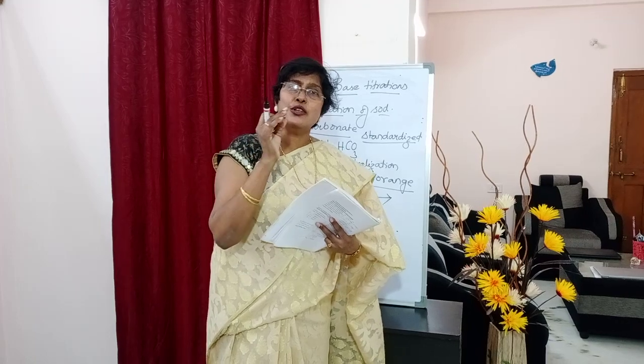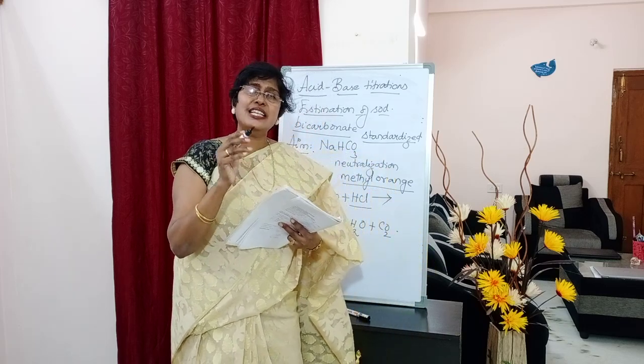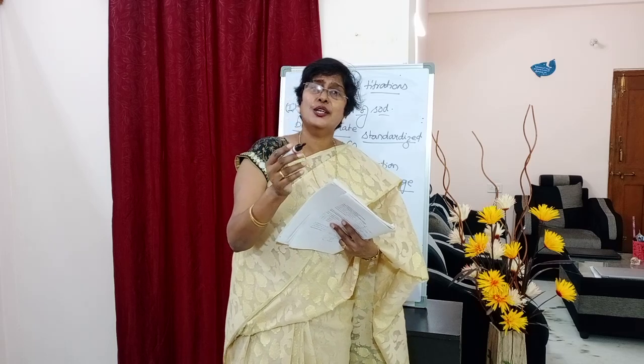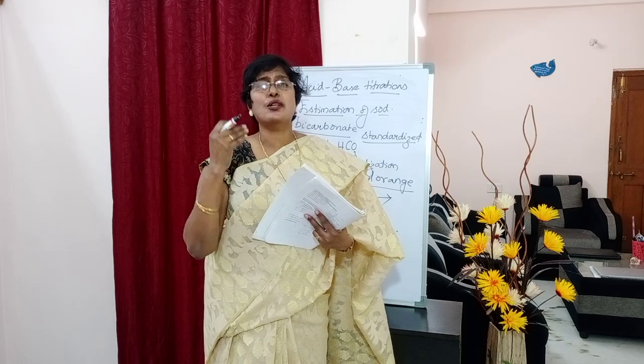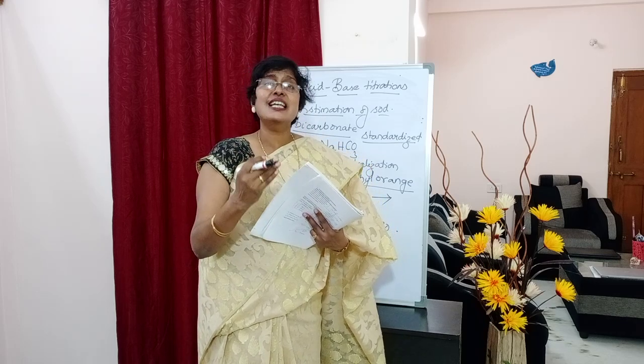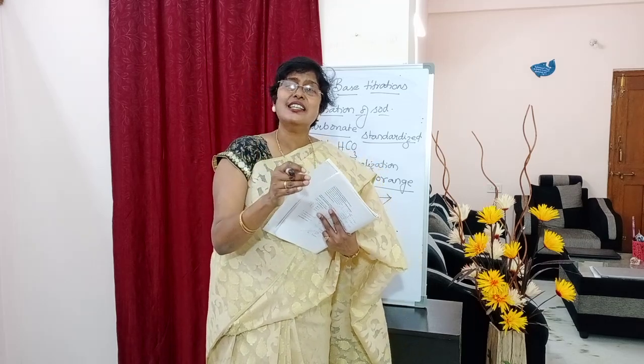Underline that standard Na2CO3. Mostly in viva, you will be asked what is a primary standard substance: one whose concentration is known and whose concentration doesn't change even after few days. Here standard Na2CO3 is the primary standard substance being used for the estimation of unknown NaHCO3, and HCl is a secondary standard substance. In order to know the amount of NaHCO3, we use HCl, but HCl is a secondary standard substance. So how is its concentration known?